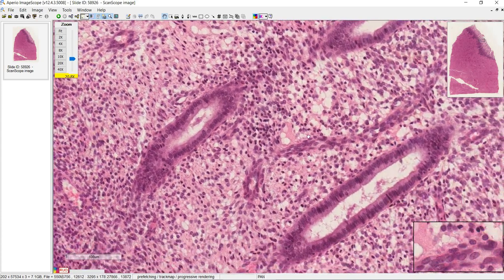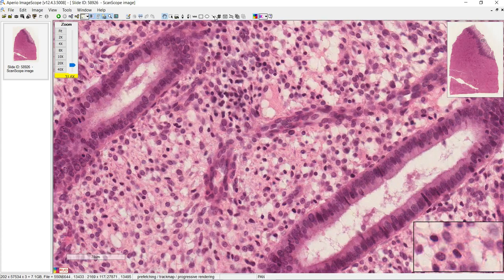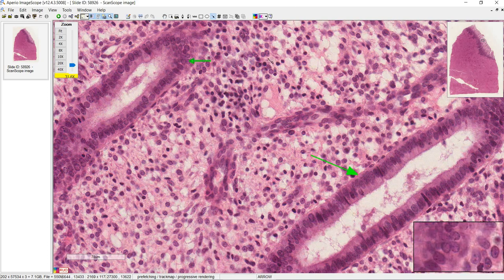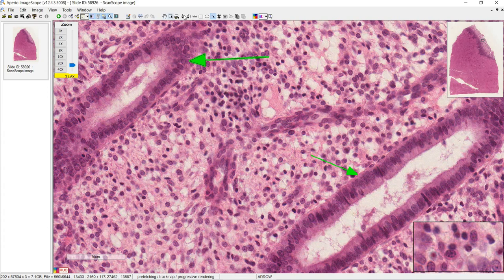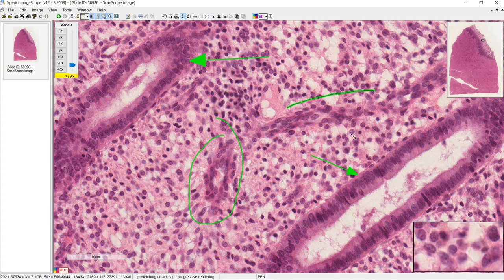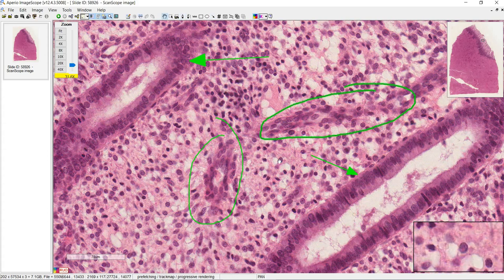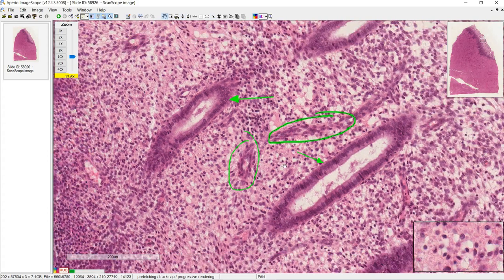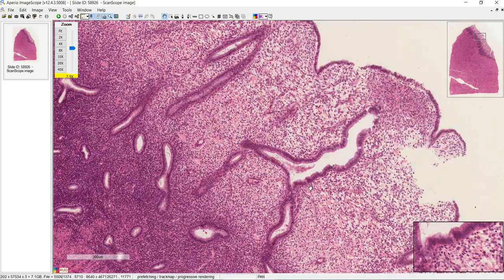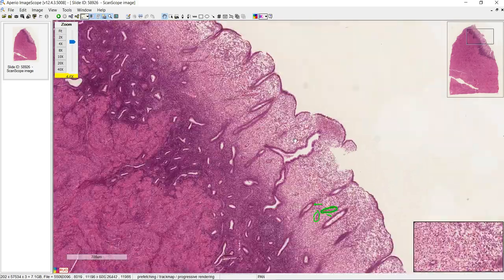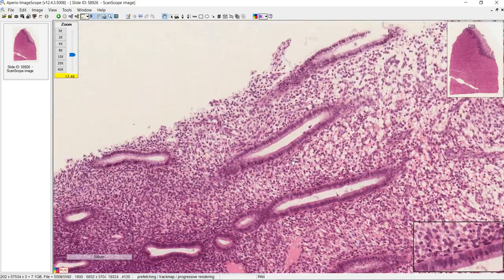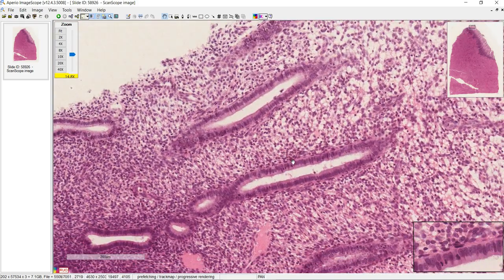Moving on to the stratum functionalis, which is the lighter staining area — again you have uterine glands, identifiable by the epithelium. Here are some spiral arteries, and it's important to recognize that this is in the proliferative phase of the menstrual cycle. You can tell by the shape of the glands: when they're straight like this, you know you're in the proliferative phase.